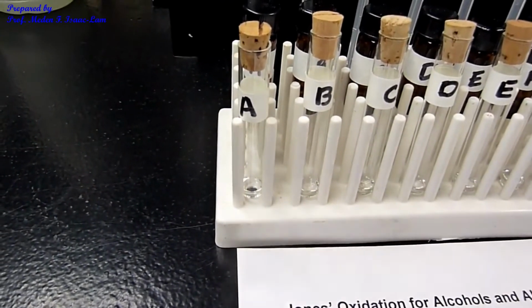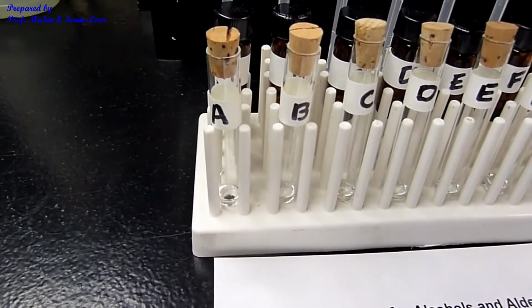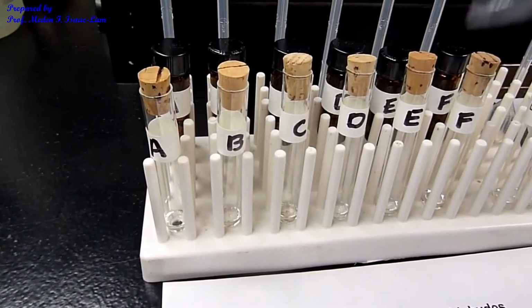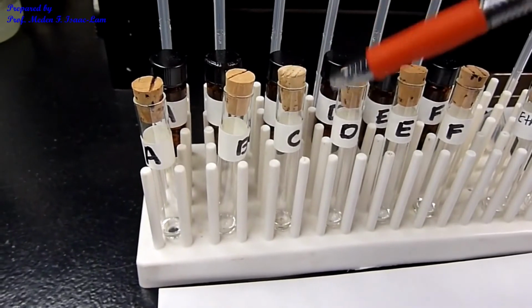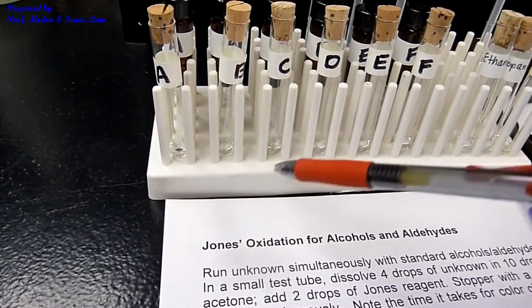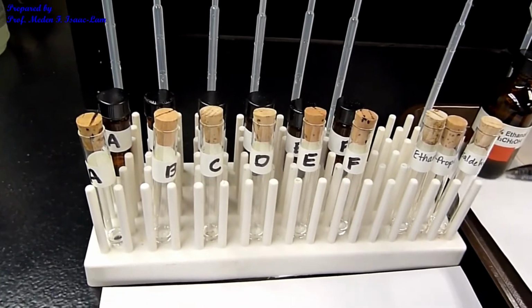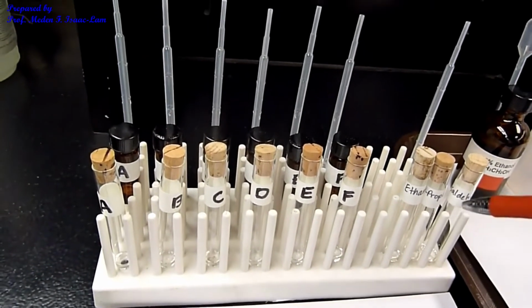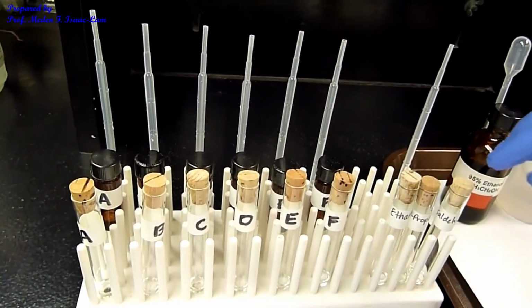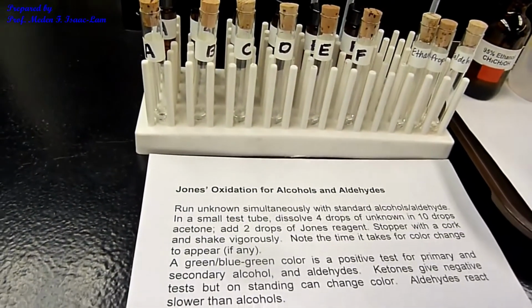So typically in a face-to-face setting, you are going to have unknowns and it will be in a vial. It's going to be labeled as a letter or as a number. In this case, we have a letter. So A, B, C, D, E, F. And then I put already 4 drops of each of the unknown and then 10 drops of the acetone. And then you will run this simultaneously with the 3 standards, ethanol, 2-propanol, and anisaldehyde. So I already add 4 drops of the unknown and then 10 drops of the acetone.